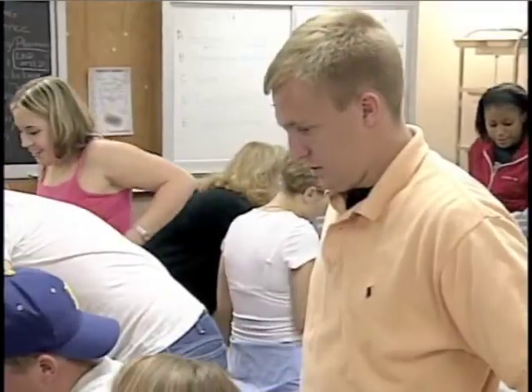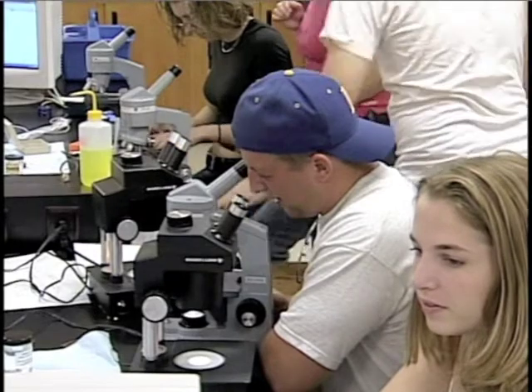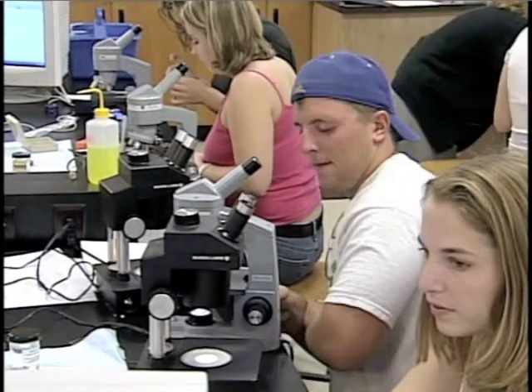Red dots around it, and round, just a blob in the middle. I don't think it's eaten. Just what you saw. Yeah, but it's not really in focus that well.